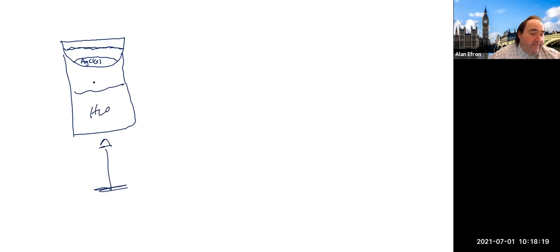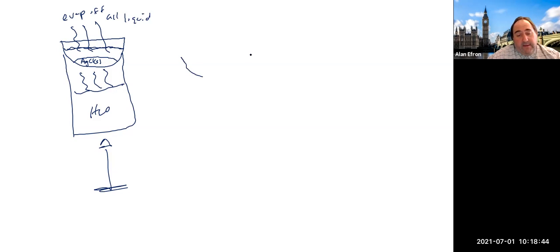And as the steam from the heated water heats up the evaporating dish, that's then going to evaporate off, hopefully, all the liquid part, if you will. And we're going to continue this process until it looks like all of the liquid has gone away. And what we will be left with at that point is an evaporating dish that contains hopefully just the silver chloride solid, no more liquid.